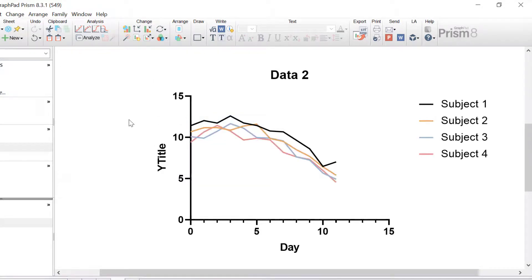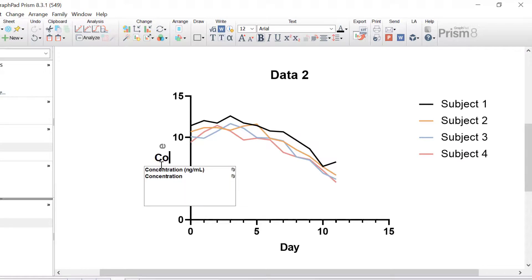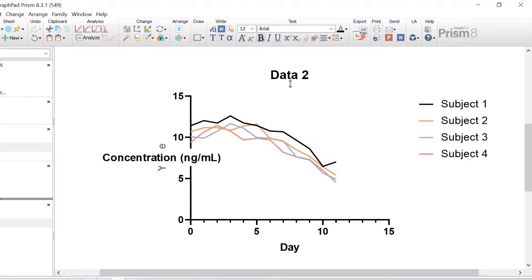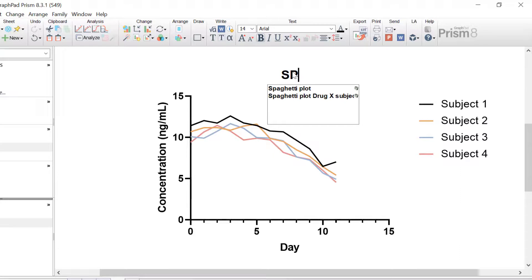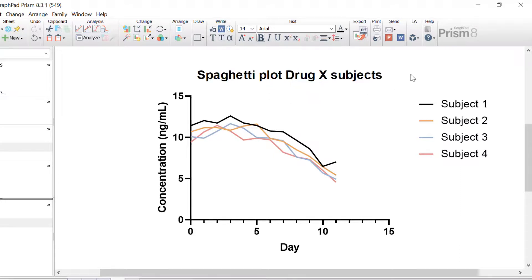Now each subject in the drug X group is in a different colour. To finish off, I'm going to change my Y axis title to concentration in nanograms per milliliter, and the graph title is going to be spaghetti plot for drug X subjects only.